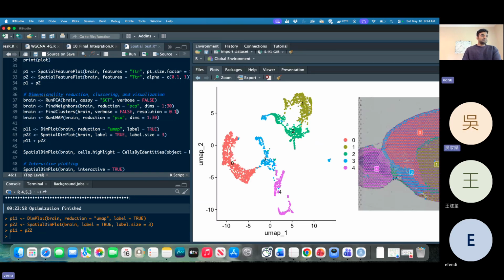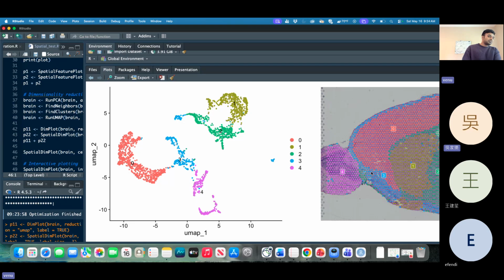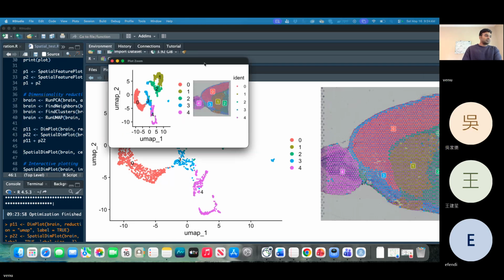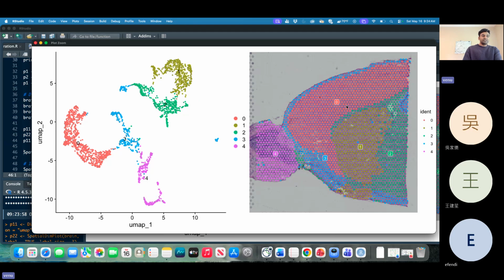Okay. So when we see 0.1, this is a very low resolution. So it found one, two, three, four. Yeah, sorry, there is also two somewhere. Okay, let's zoom in on this. So it found four, five clusters. So these five spots all have similar expression. So again, we went down one more step. These zero, maybe these groups are like second layer. So like that, we are giving layer by layer. So again, zero we are splitting into some other, one we are splitting into some other, based on their expression of markers.